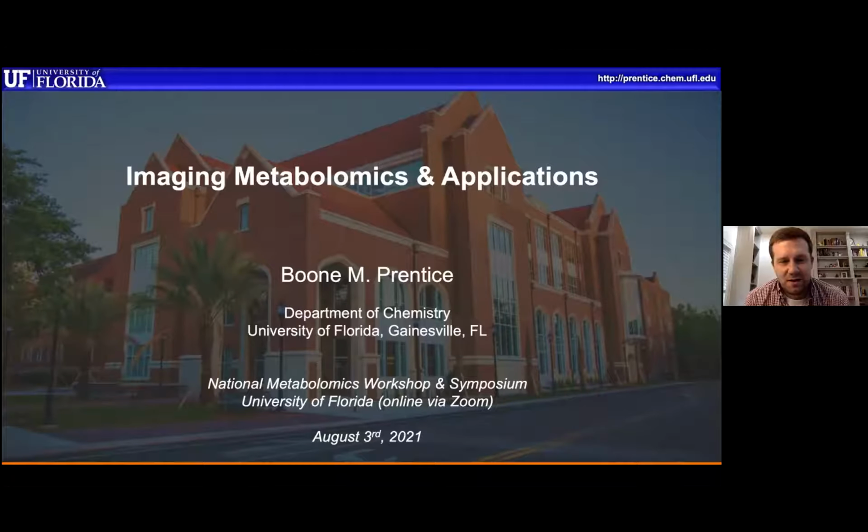Thank you, Siju. It's my pleasure to speak with you all today and introduce the concept and workflow of imaging mass spectrometry or mass spectrometry imaging. You'll hear it termed either way, IMS or MSI. So what I'm going to try to do today is strike a balance in, over the next hour or so, talking about some of the fundamental aspects of imaging, how we do the imaging experiment and how it works at a fundamental level. I'll also try and highlight some of the important experimental parameters that we need to consider when setting up or designing an imaging experiment.